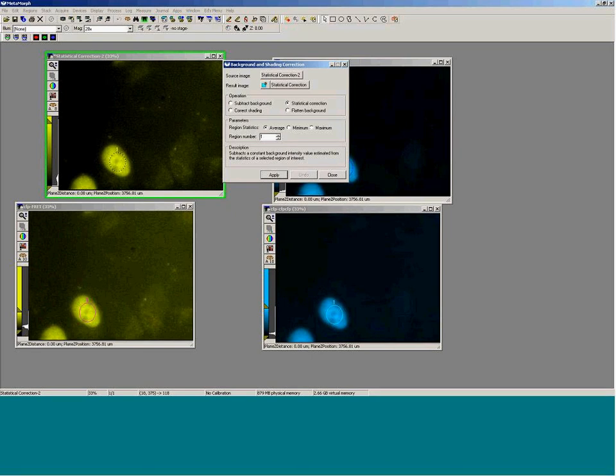So if we go to the apps menu and look at FRET, our donor image is the CFP image. Our acceptor image is the YFP, and then our FRET image is the FRET that's here. Okay, so those are the three selections we're doing sensitized emission. In this case, these are the raw images. I haven't done any correction for them, background subtraction for them.